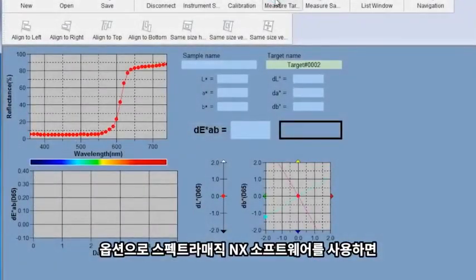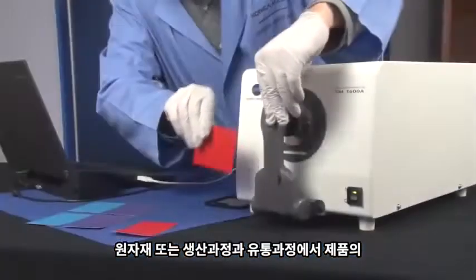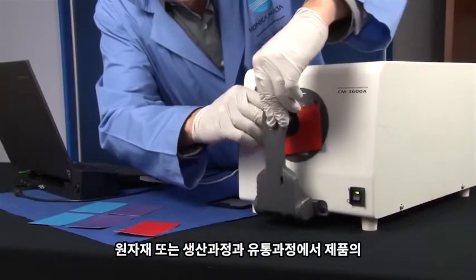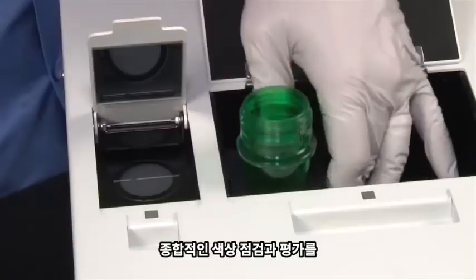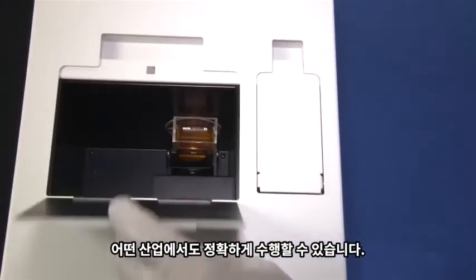Driven by powerful optional software SpectraMagic NX, users can perform comprehensive color inspection and analysis of incoming raw materials, in-process production, and outbound color-critical goods and materials in virtually any industry.